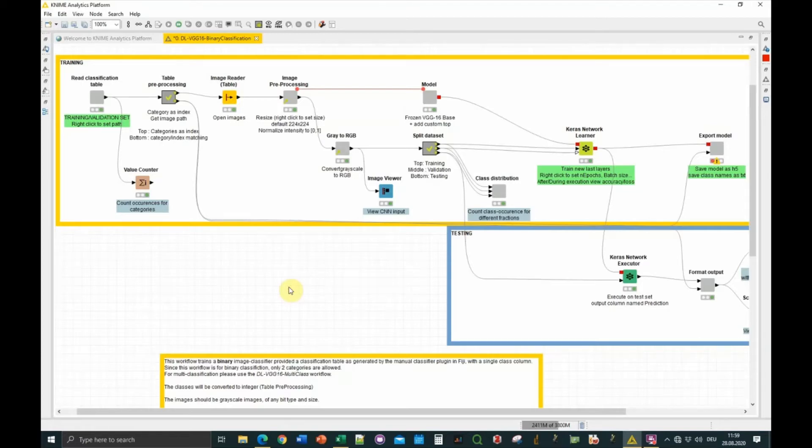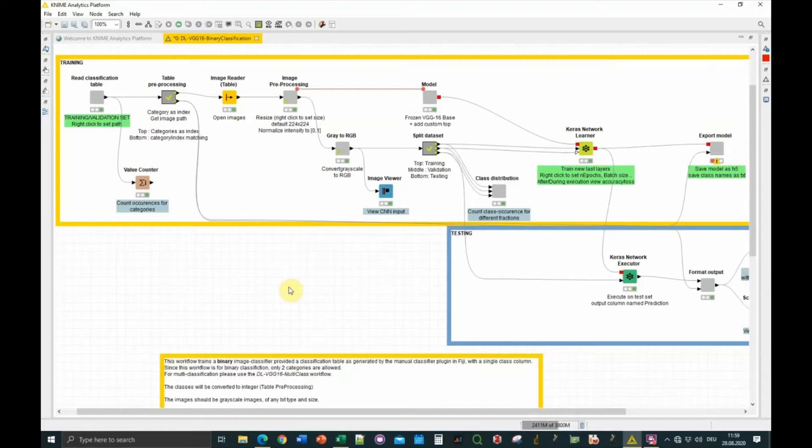Hi, this is Laurent Thomas for another tutorial about Fiji plugins and their application. In this case, I want to show you how to use the annotation generated with the qualitative annotation plugin to train an image classifier using deep learning in KNIME.